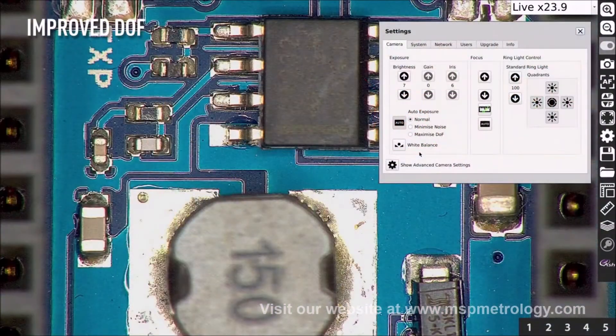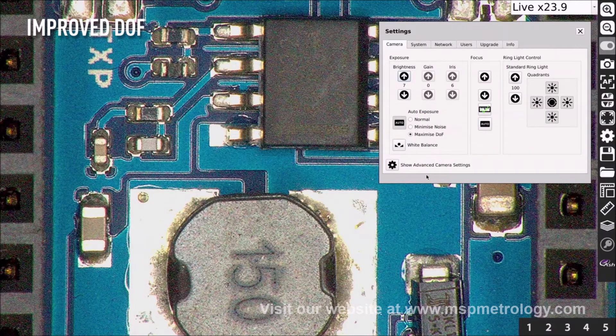The InSpecs 3 has improved depth of field, making inspecting parts much faster and more efficient, without the need for changing focus positions or adjusting camera height.